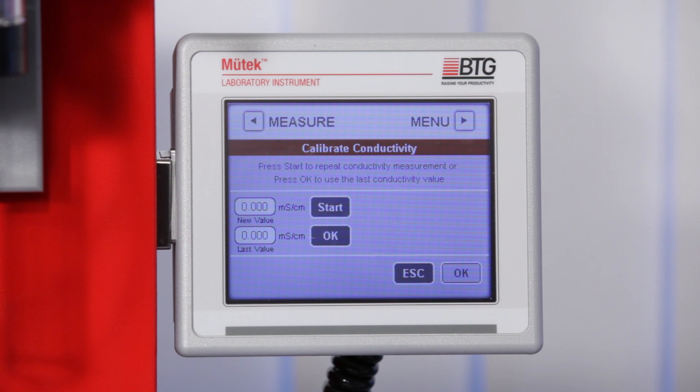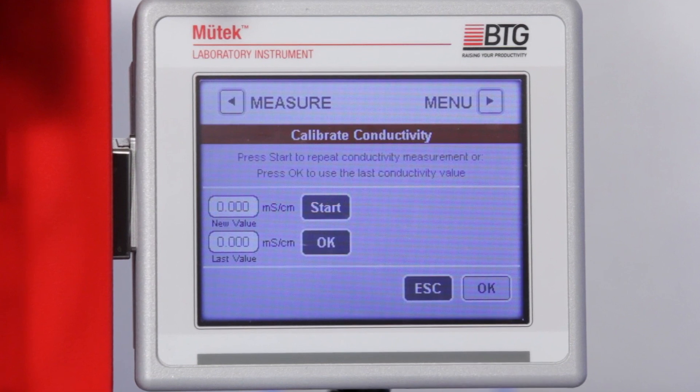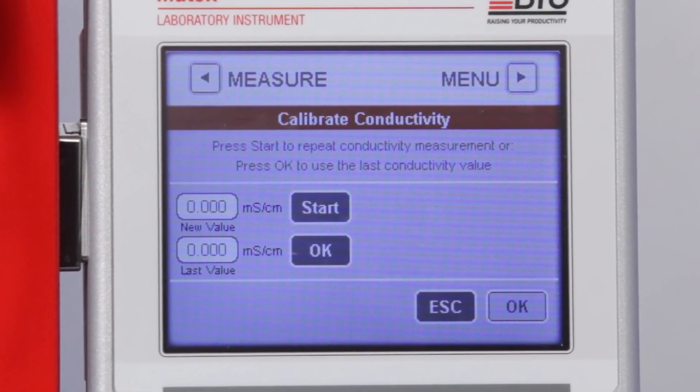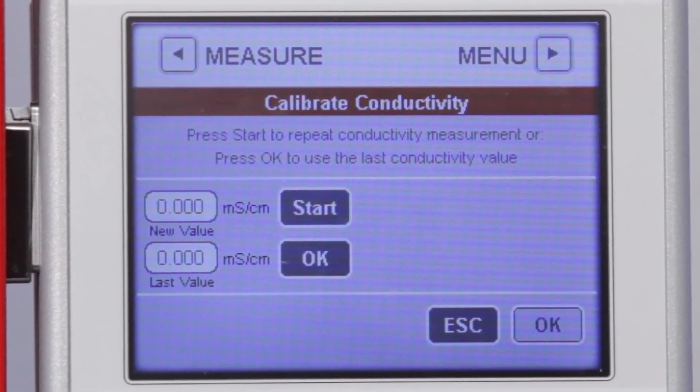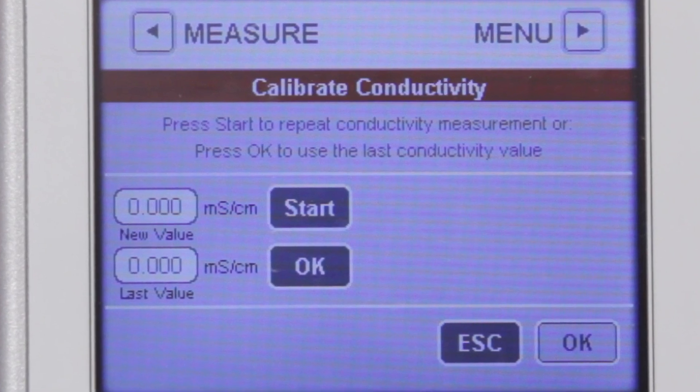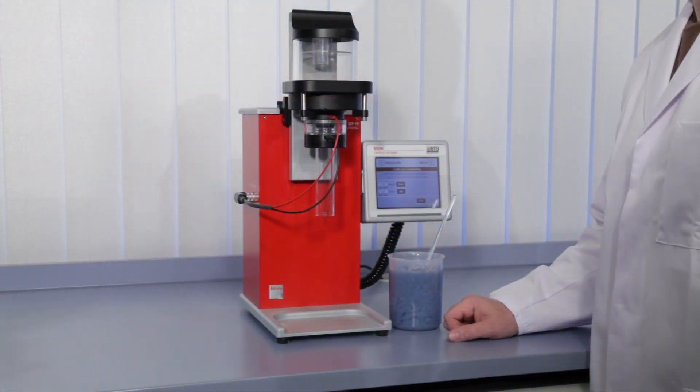Whenever the SZP's conductivity reading differs from an external reference value, the EL factor can be recalibrated to compensate the offset. This is done as follows.